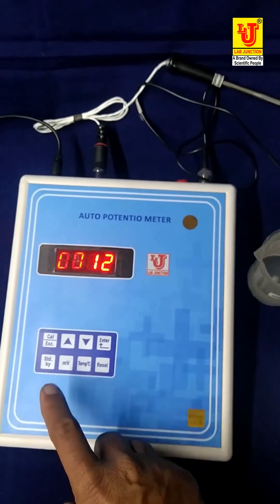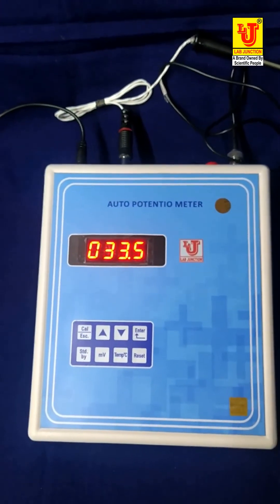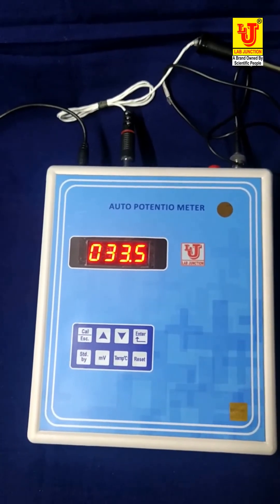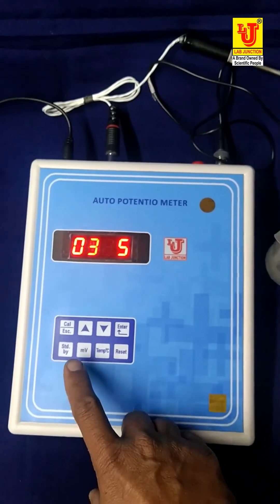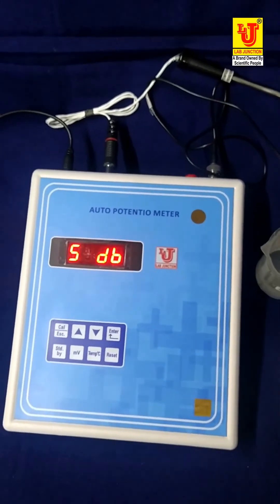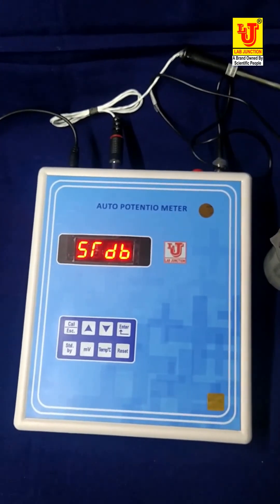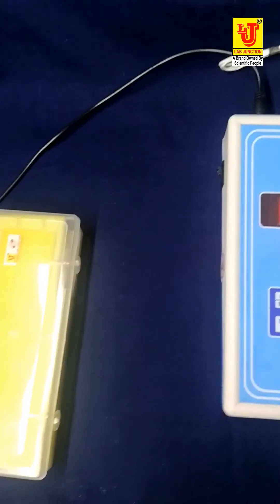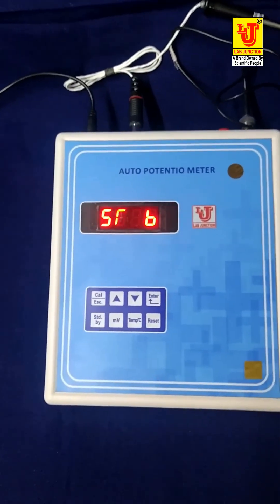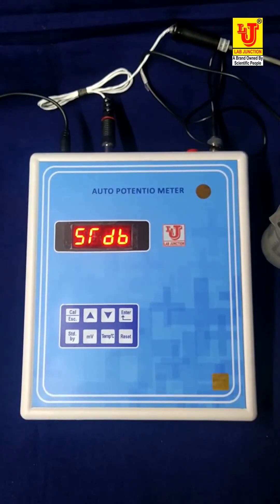Now I am maintaining standby position like this. To check temperature, press the temperature key — it automatically shows the temperature. Now I am pressing the standby key. This is the complete demonstration of auto potentiometer model LJ1118 by Lab Junction.